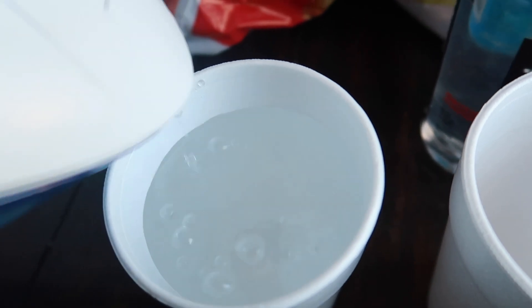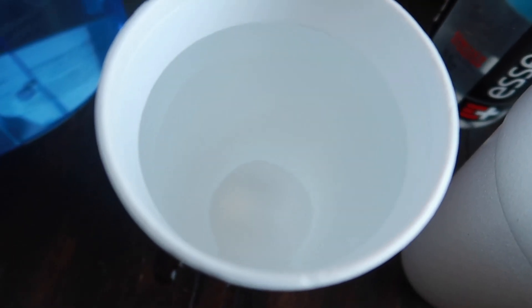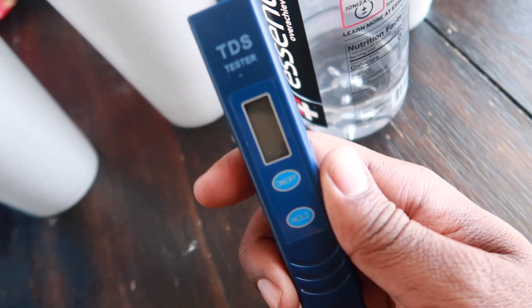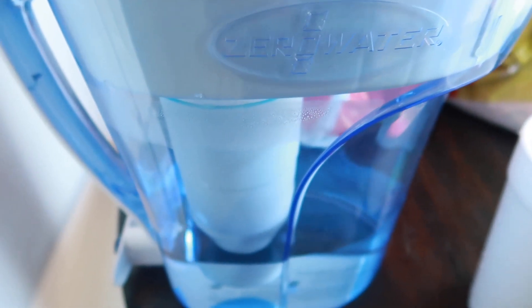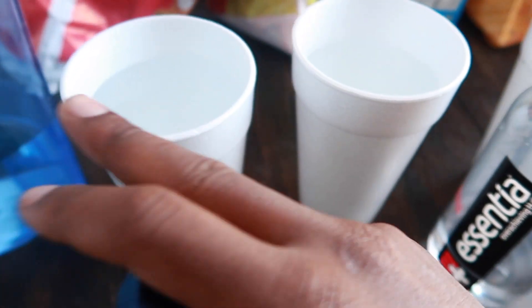When you buy the Zero Water pitcher, it comes attached with this water testing tool. This TDS tester helps you test the purification of the water. If you put the TDS tester in the water and it comes up with any number, that means the water has dissolved solids and it's not 100% purified. Zero Water claims to purify the water 100%.